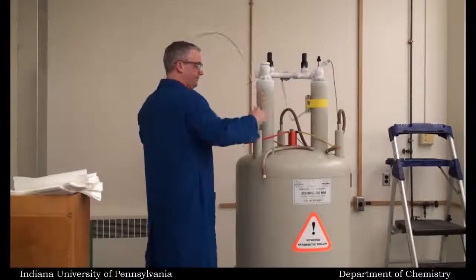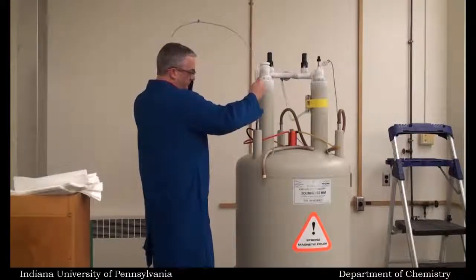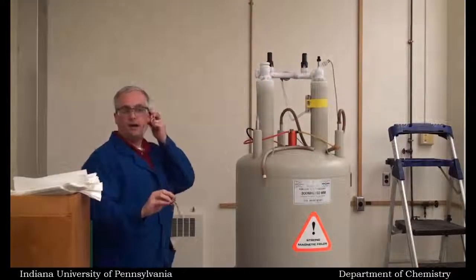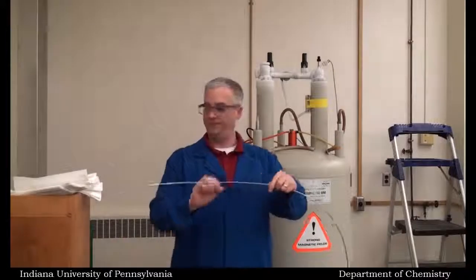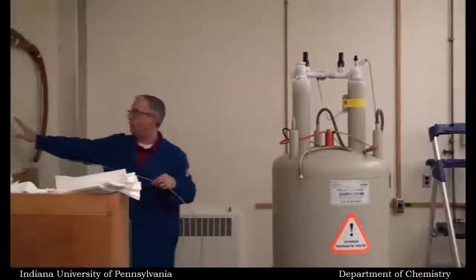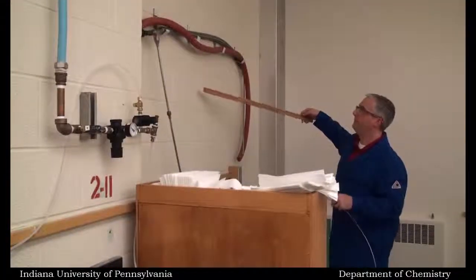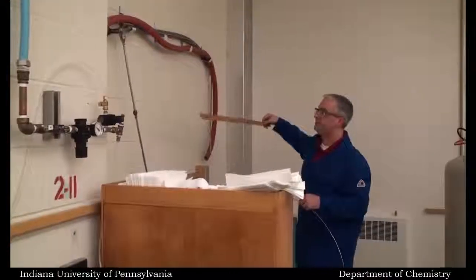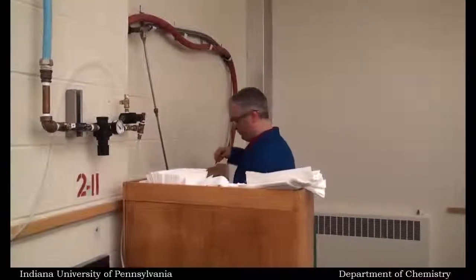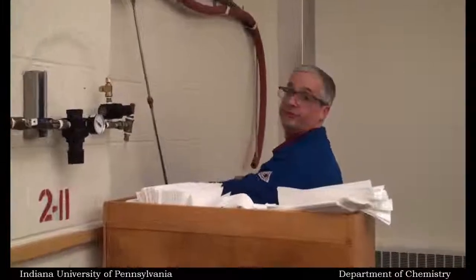So, without much ado, let's do it. I'm going to go ahead and stand. I'm going to put this next to my ear. Alright, so I got a good bit of liquid nitrogen touching my ear, and so this is the distance. Over here, underneath where we keep our tubes, you'll see that we keep a meter stick. This is our centimeters. Just by looking at this, going from 0 and straightening out the tube, I can tell that I'm at 54 centimeters.